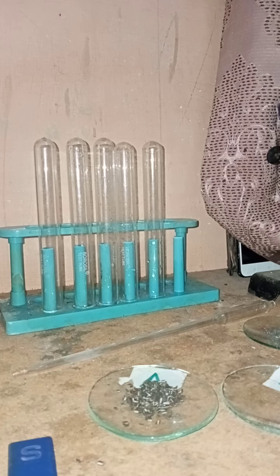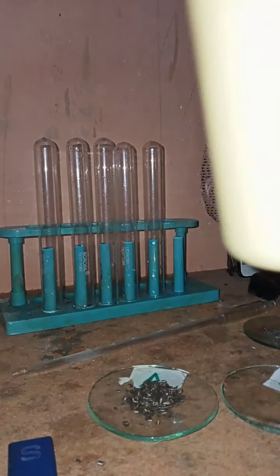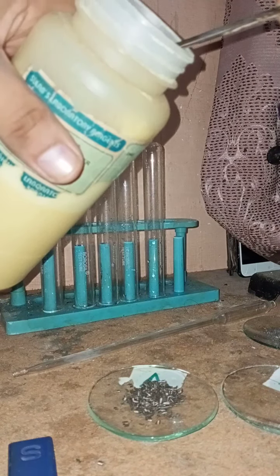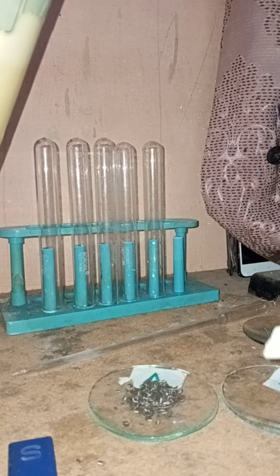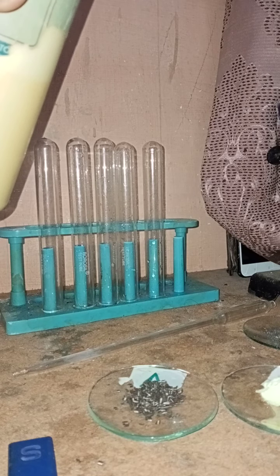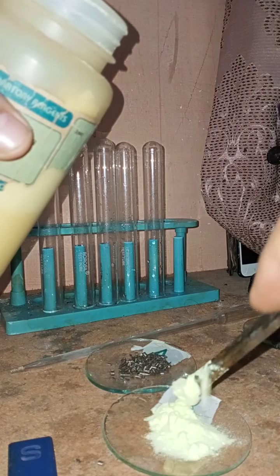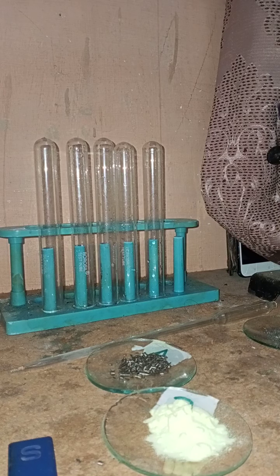Now I'm going to add the sulfur powder to watch glass B. So this is how I'm going to add the sulfur powder to watch glass B. You can see the yellow colored sulfur powder is being added to watch glass B. This is our sulfur powder. Now we are going to do some tests for us. So let us see how the test goes on.